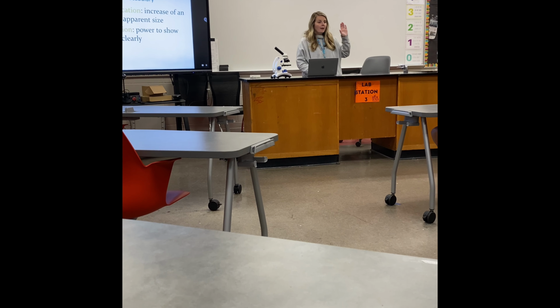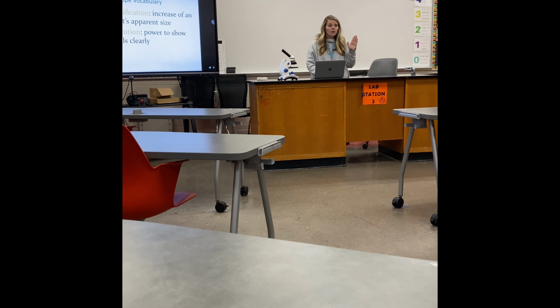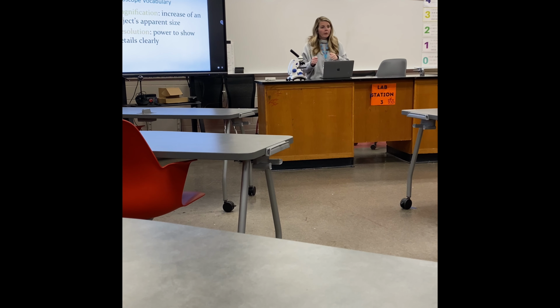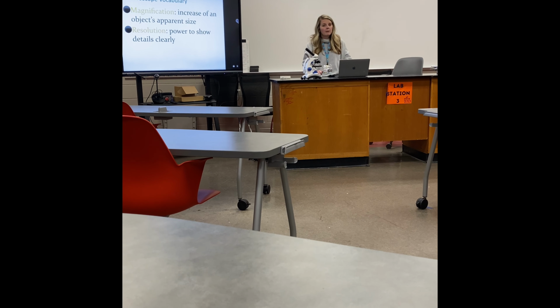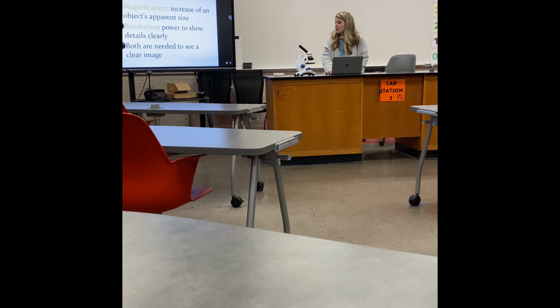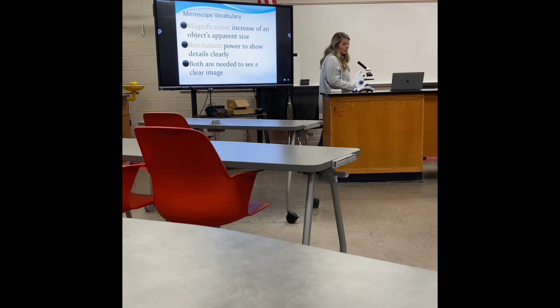If you have a picture that you take that's really crisp and clear and you can see everything that's going on, that's high resolution. But if you are taking a picture with your phone and you shift really quickly, that picture's real blurry, right? Okay, that's low resolution. So we want high resolution when we're looking at specimens under the microscope. Both are needed to see a very clear image. That's what we're going for, okay, a very clear image.